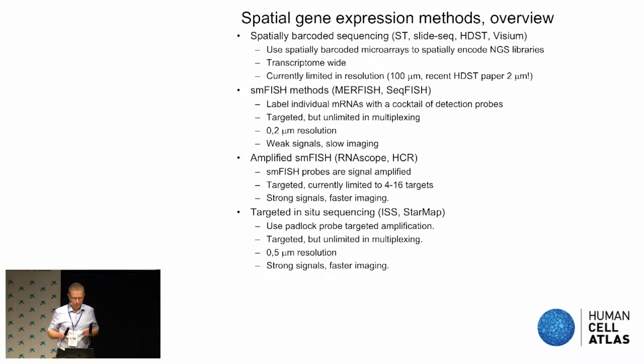So first, general overview. This is a very rapidly evolving field. It's quite exciting to see the papers coming up on bioRxiv on new methods and approaches. So the examples given here are not at all an exhaustive description of the different approaches, but I've tried to classify or identify 4 fundamental different approaches to generate spatially resolved expression data.